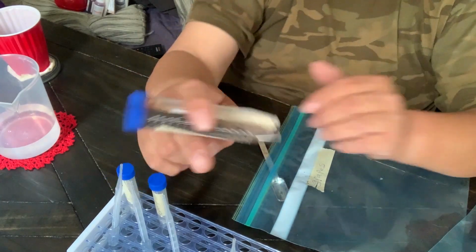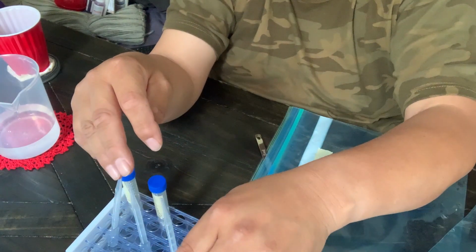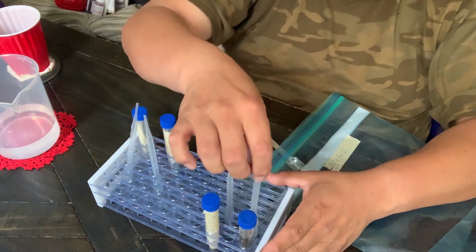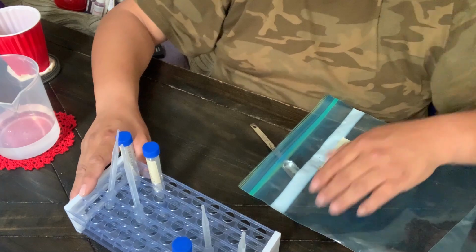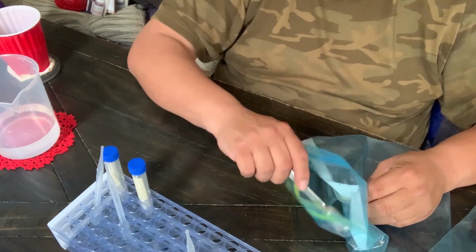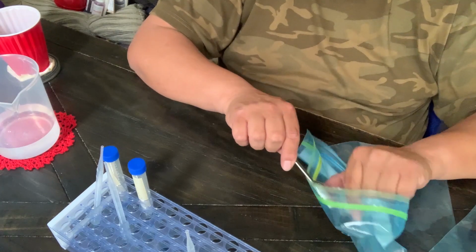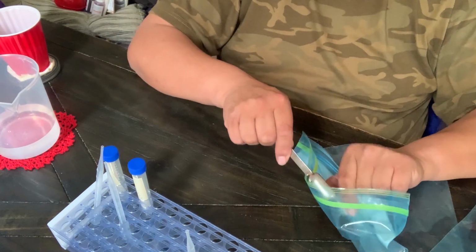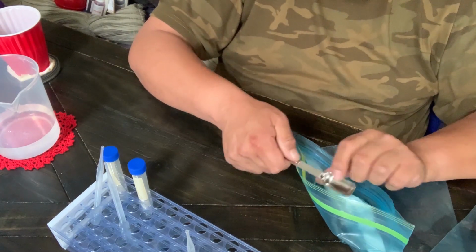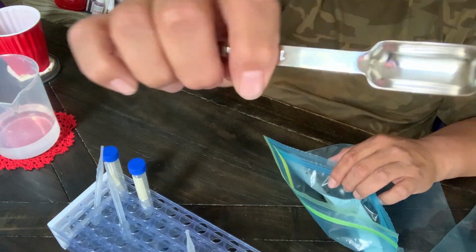All right, that seems to be enough. I'm gonna have to do that again. So here we have the grapes. Here we have the compost. Now we got two more specimens here to go after. And then, this is what's good about these stainless steel spoons here. Very easy to clean. There, see, it's all clean.